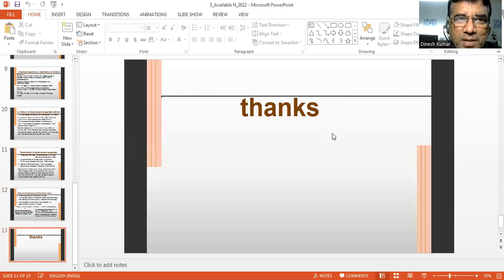So thank you very much. If you have any questions, your questions are welcome. I will be happy to answer any question on total nitrogen and available nitrogen. But so far, this decomposition of organic matter, I will very soon take one lecture in detail, because these are, you can say, artificial decomposition of organic matter in the lab by wet ashing or by dry ashing, which is also done in the laboratory. But in nature, it is decomposed by microbes.